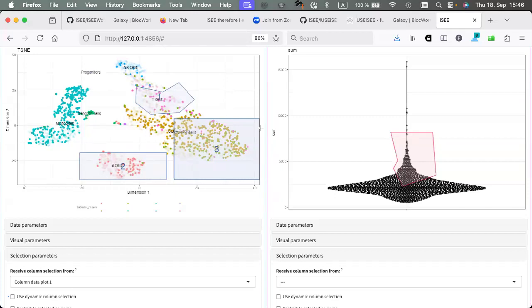More questions, or otherwise, please. Questions and comments. I like it very much because it's a kind of loop where you can do all clicky, but then you have all the comments recorded, which is what you're missing, and to show all the collaborator. So congratulations first. I'll share it with the others.